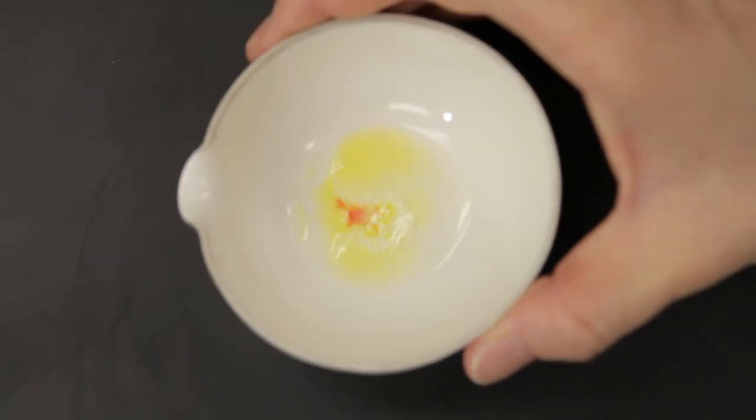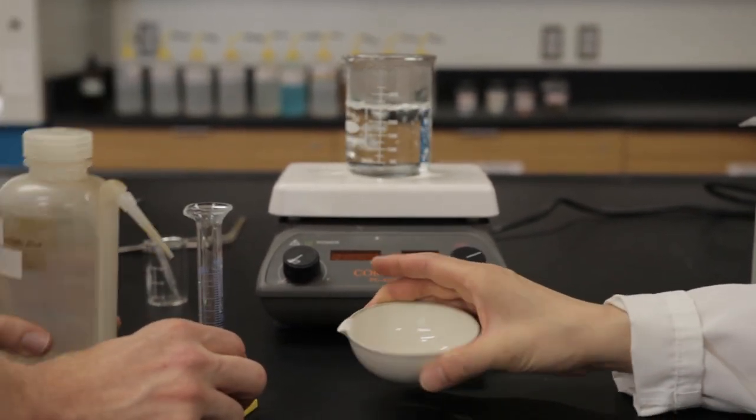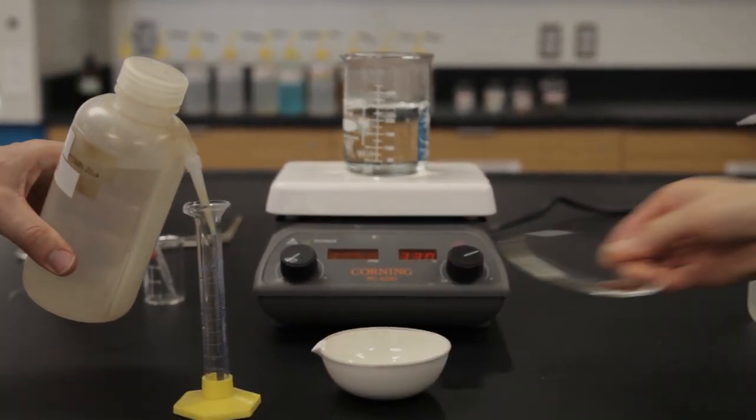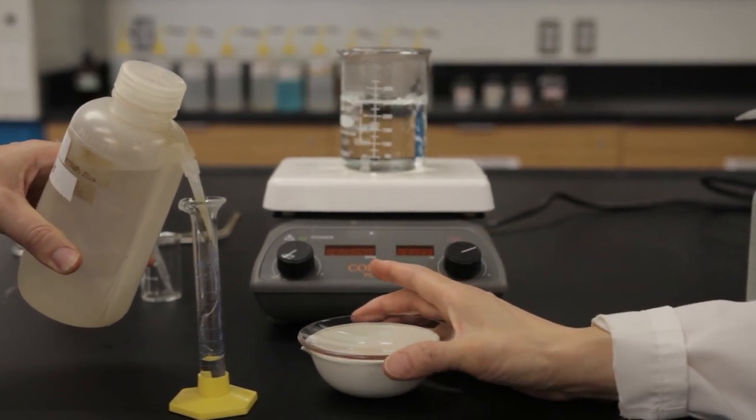Obtain about five milliliters of 3.0 molar hydrochloric acid in a graduated cylinder. Cover the evaporating dish with a clean and dry watch glass.